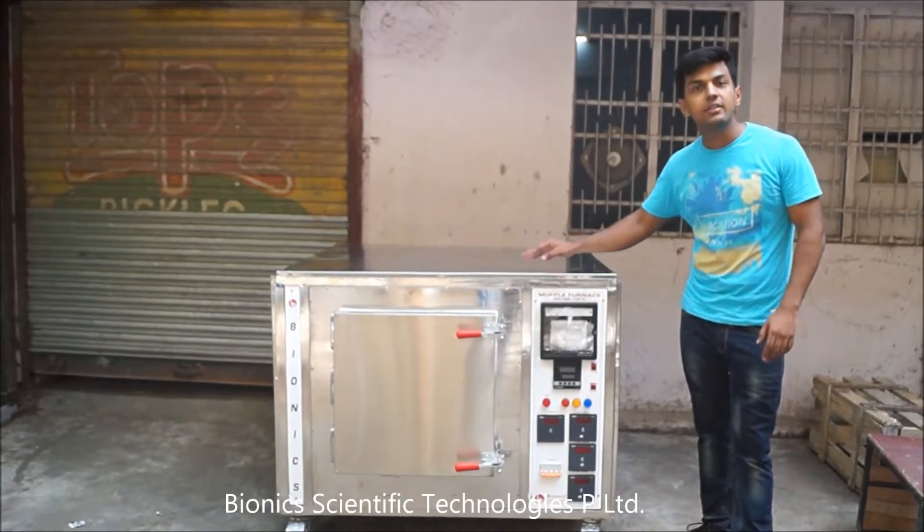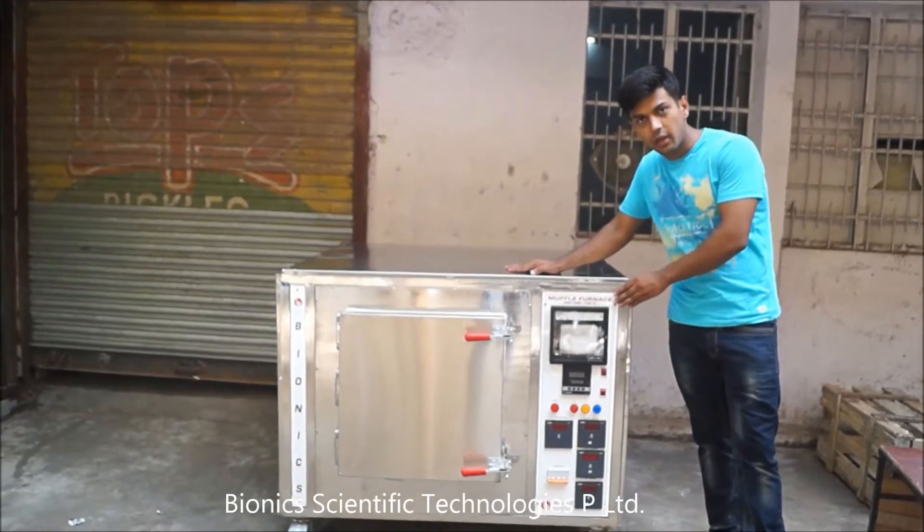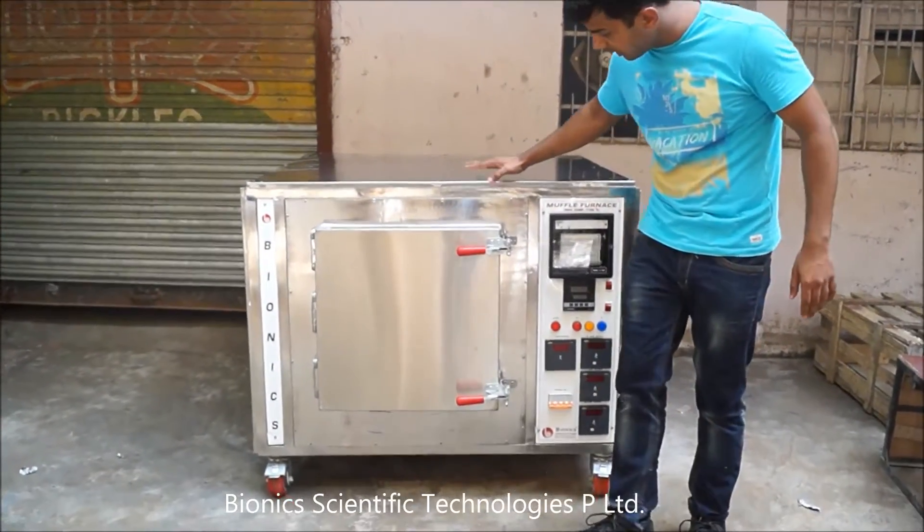Welcome to Bionics Scientific, where this is our product, the muffle furnace. As you can see, it is made up of stainless steel.